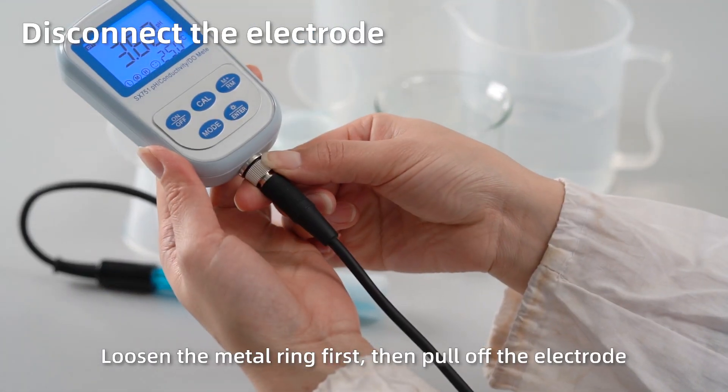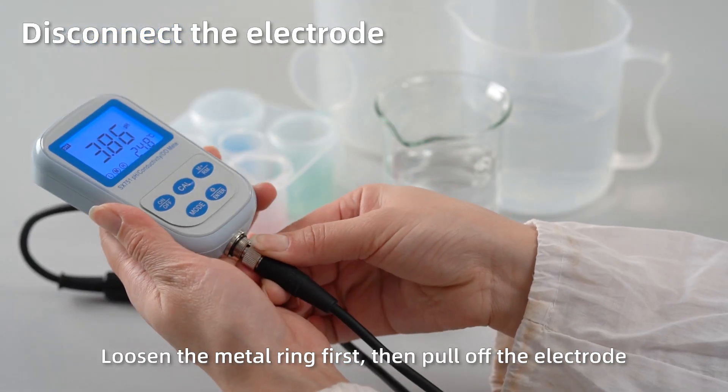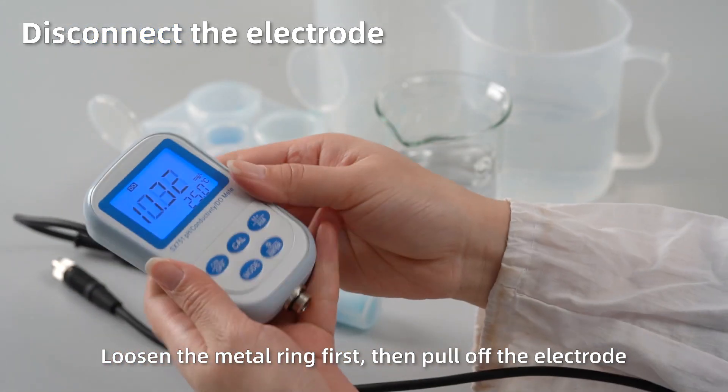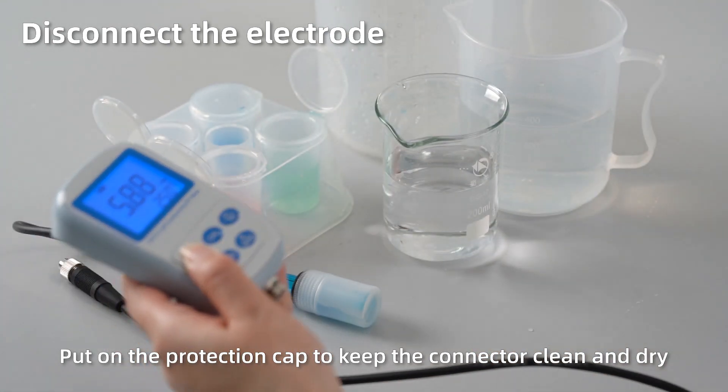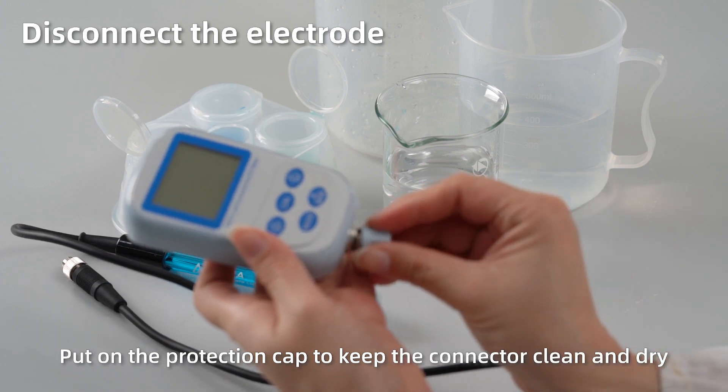Disconnect the electrode: loosen the metal ring first, then pull off the electrode. Short press Off to power off. Close the protection cap to keep the connector clean and dry.